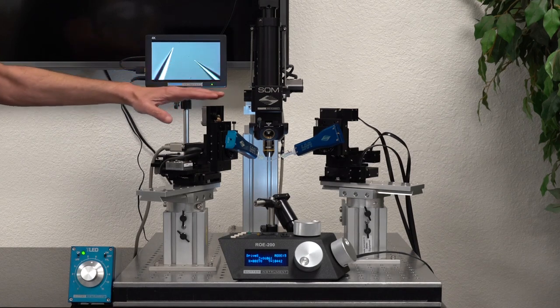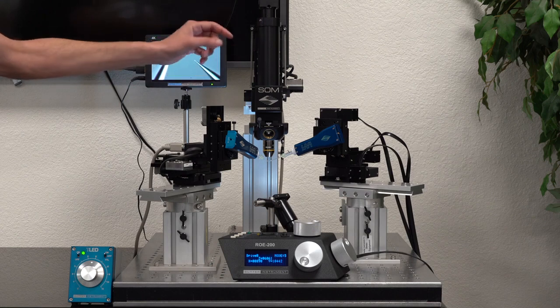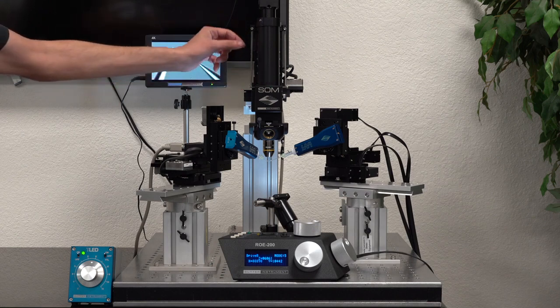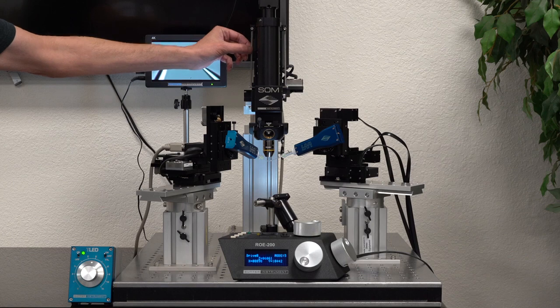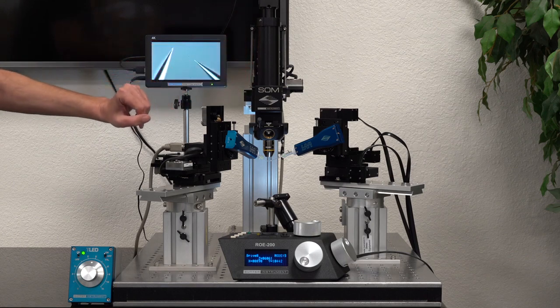In this case we have taken the 285 here and made it into a microscope. I also want you to note that because of the weight of the microscope, we have reinforced the Z-axis with these extra springs on the side.